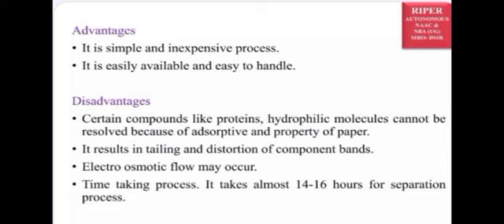Third point, electroosmotic flow may occur. Sometimes electroosmotic flow occurs. The fourth point, it is a time consuming process. It takes almost 14 to 16 hours for the separation process. So it is a time taking process. These are the advantages and disadvantages of paper electrophoresis.